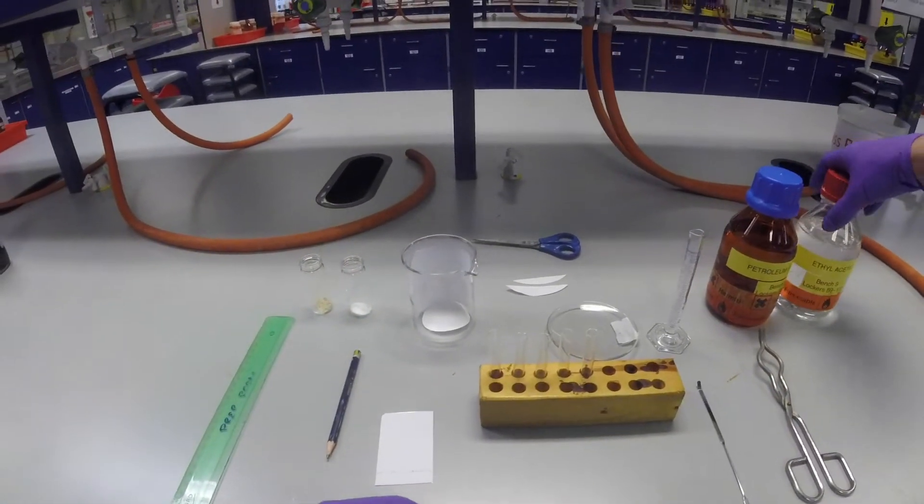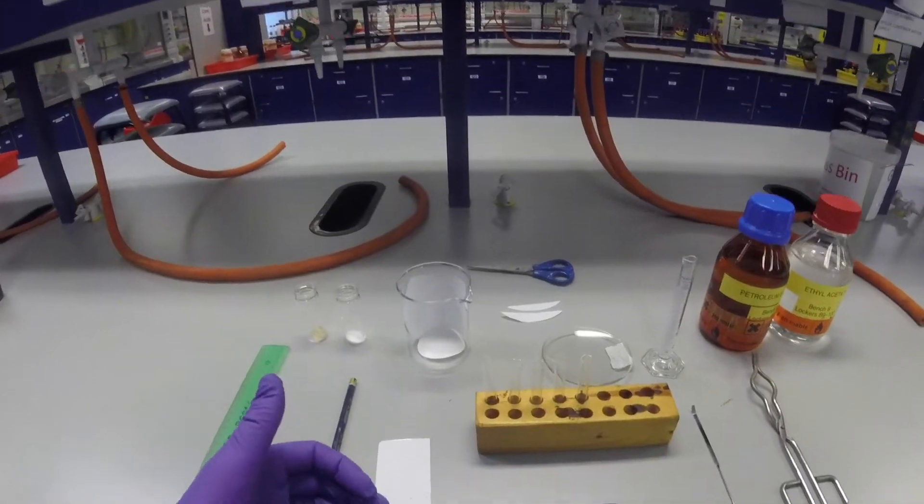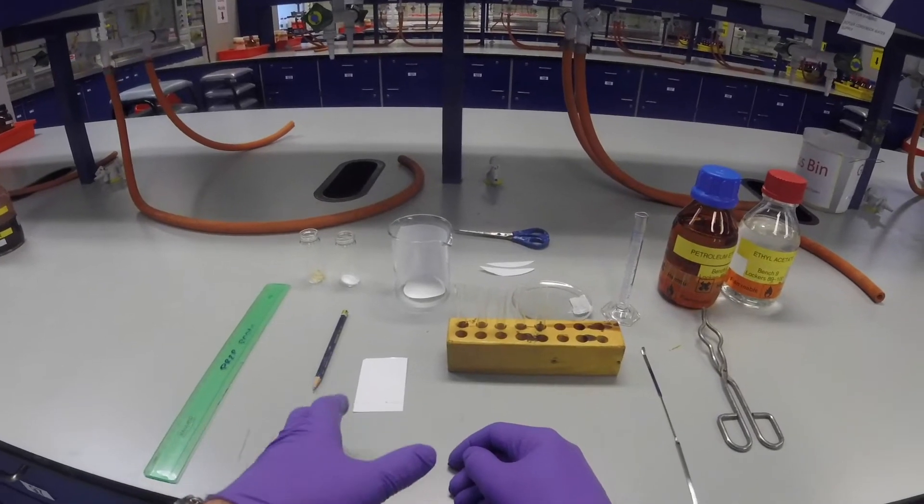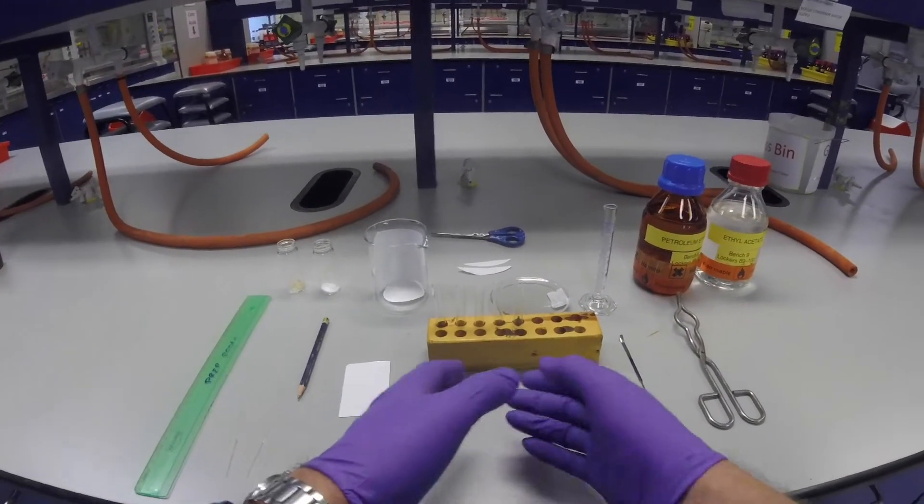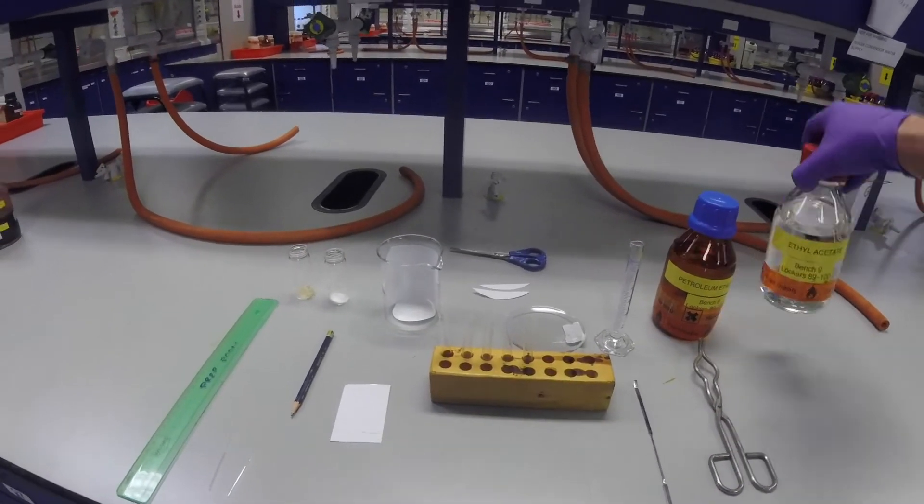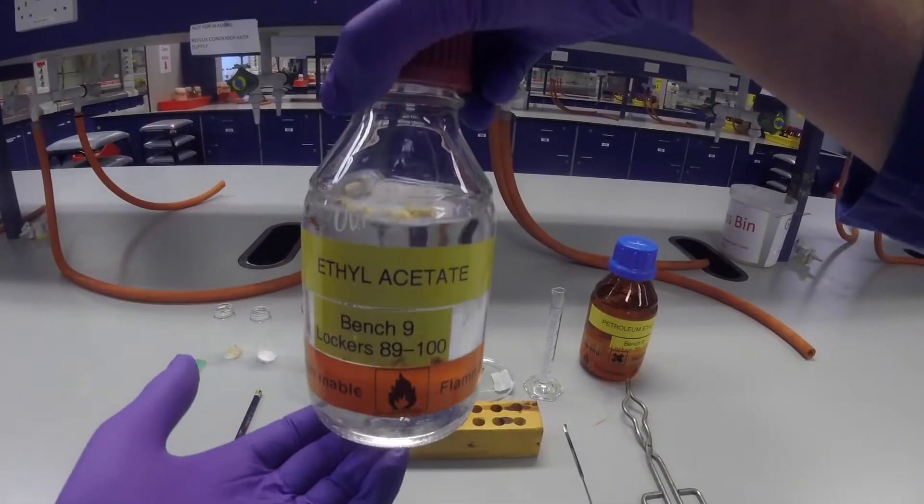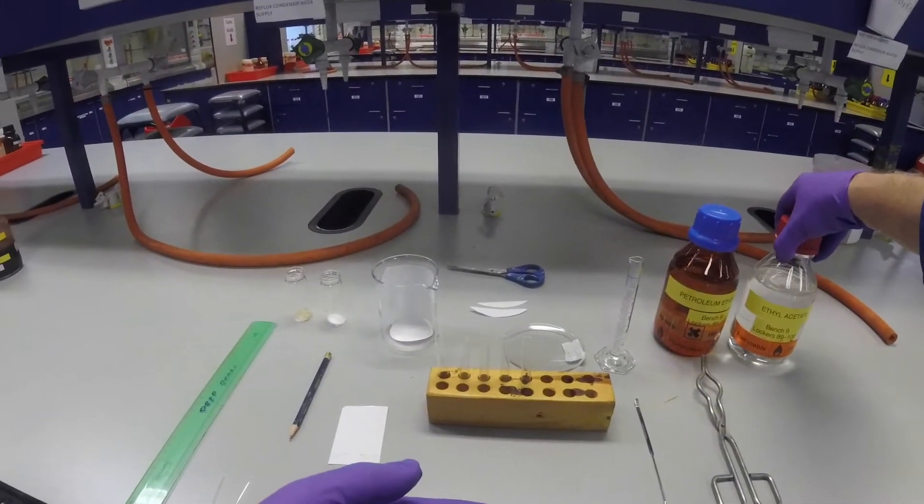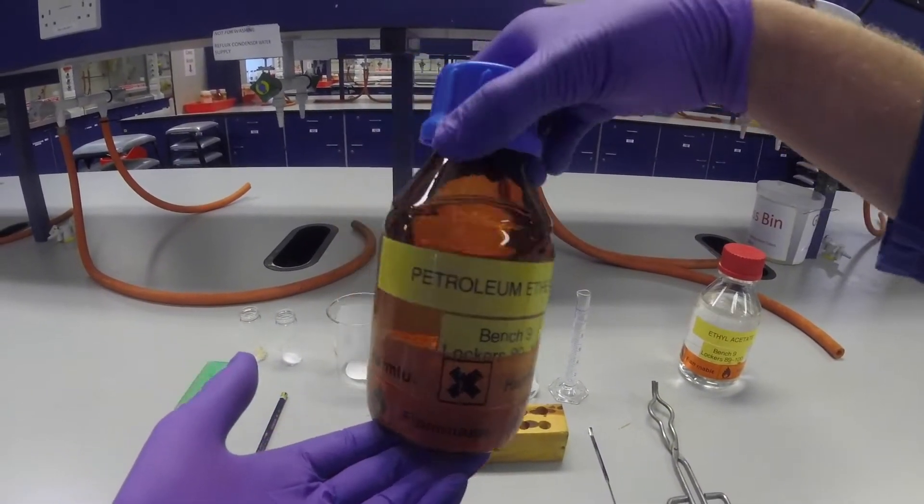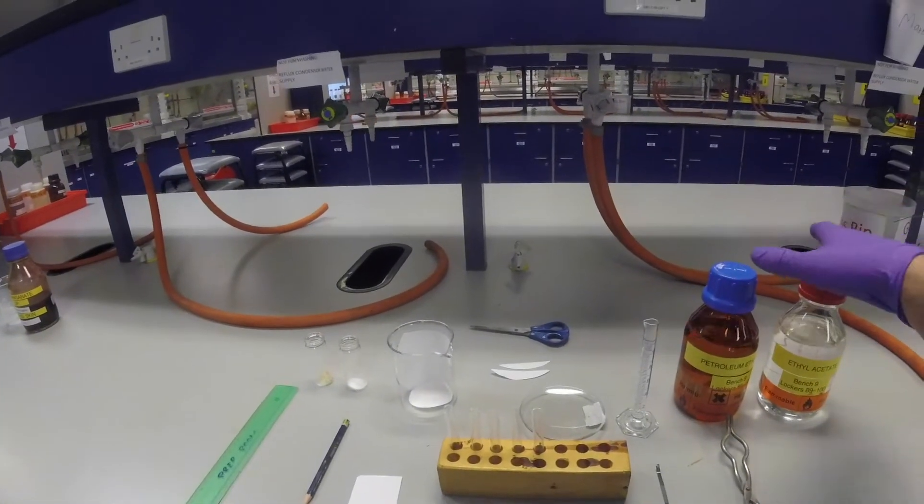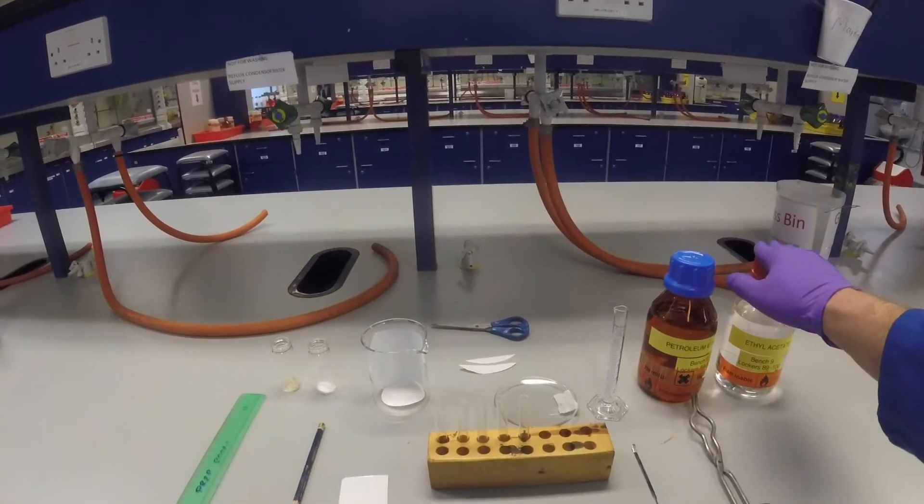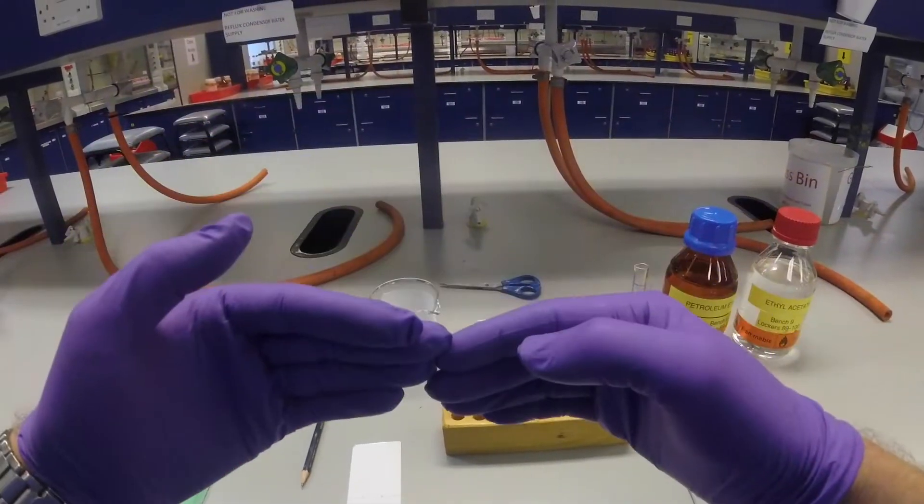Then we have our TLC eluent, the solvent system that we're going to use. This mixture can change depending on the TLC you're running, the reaction conditions, and what kind of compounds you're looking at. Generally it's a mixture between two different solvents, one which is the more polar component—in this case ethyl acetate—and for our non-polar component we're going to use petroleum ether. You can change the ratio of petroleum ether to ethyl acetate, of non-polar to polar, and it will change the rate at which things move up or down the plate.